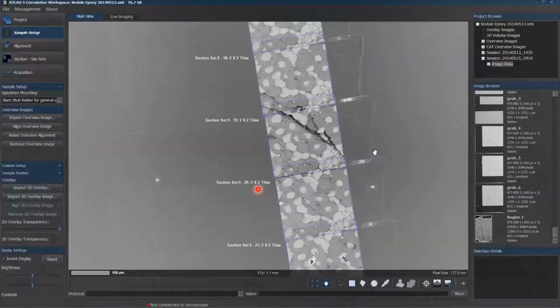In the next step, we would take a first image. Normally this is done at fairly low resolution. Down here, you can see the icon or the letters Protocol, where you can define an imaging protocol. That might be high resolution already, or low resolution to just grasp an overview. In that case, this is a sample that is collected in that ribbon format, not on the tape. I just used it as an example that this interface allows you to do both: the tape collection system or these ribbons sitting on the silicon wafer.